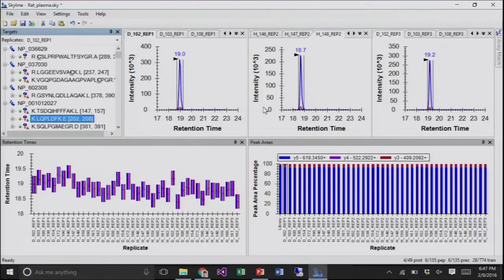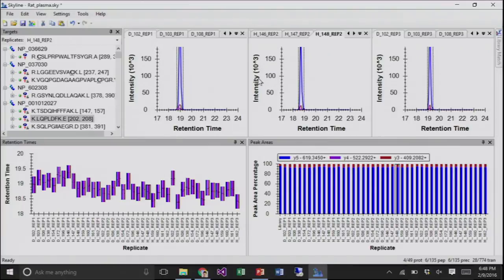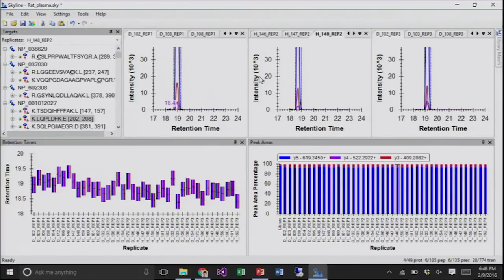If you want to zoom into the y-axis and look at something closer up in the y scale, the same with the x scale, you can put the cursor in the middle to the left or below either scale, and then if you use your mouse wheel, you can scroll in just one dimension. And so when I look at it, okay, there's actual signal on those other things. They're not just flat.